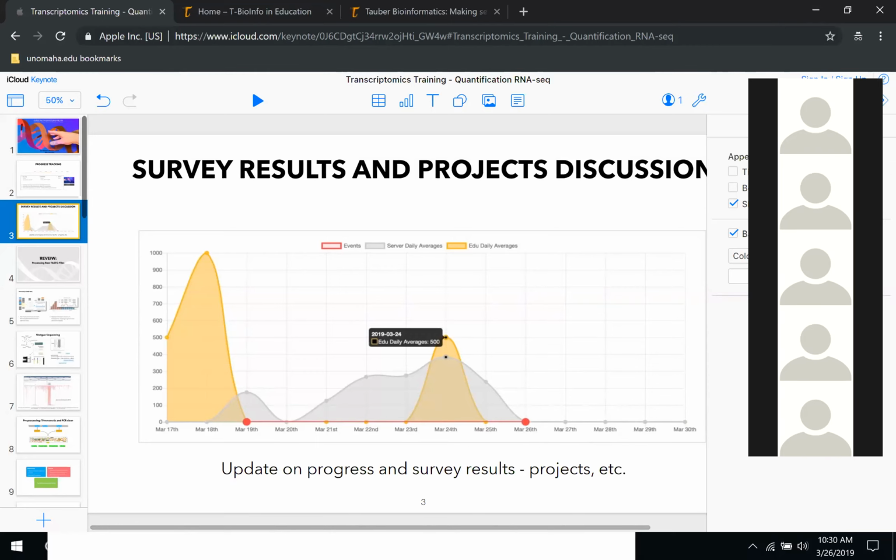I'm sorry, Sahil. I just have a question. Sure. I'm myself from Asia, and I just have a basic question. How do you map a reference genome? As you see, for example, in the NCBI database, you have different versions of the genome.